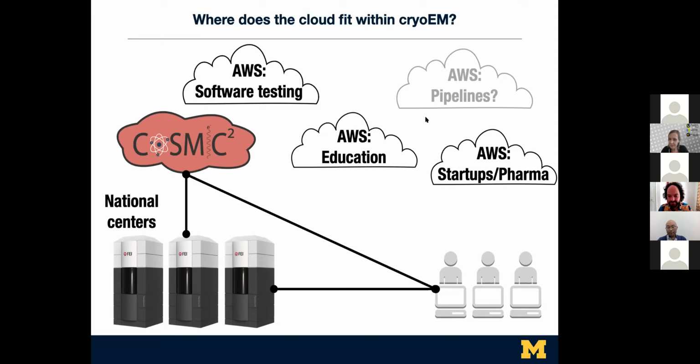Someone asked about using RELION. If you're doing it locally, you have this directory structure and everything is maintained, and you lose that when you're running in Cosmic 2. So is there some way to get everything back in that logical directory structure?